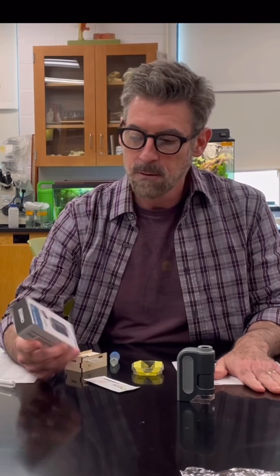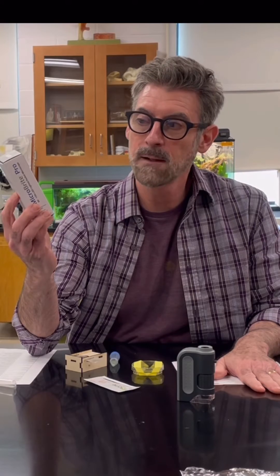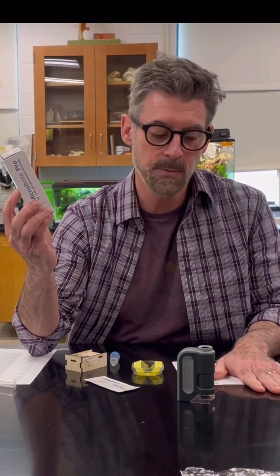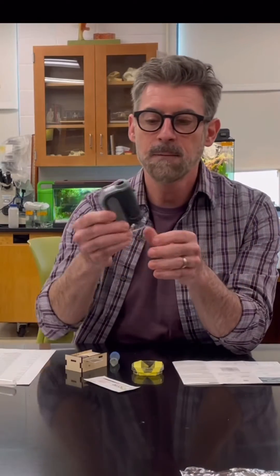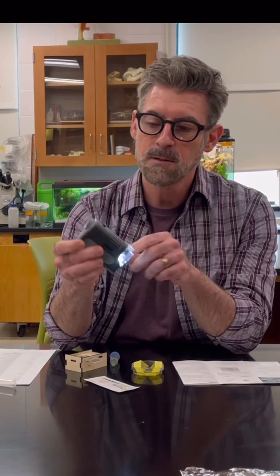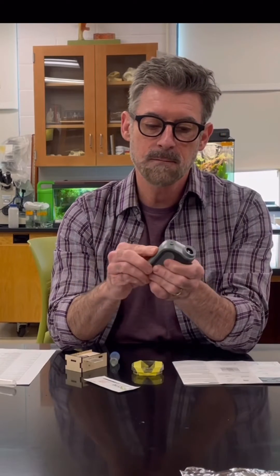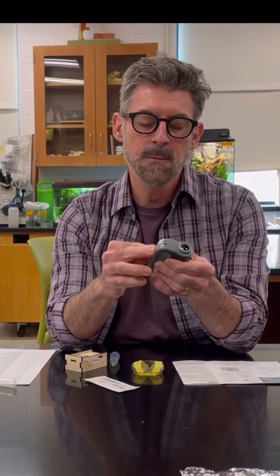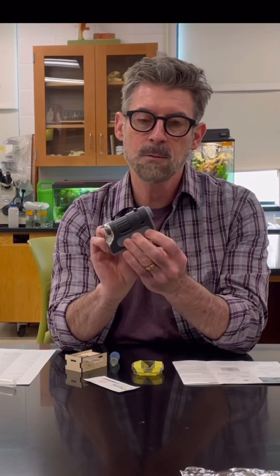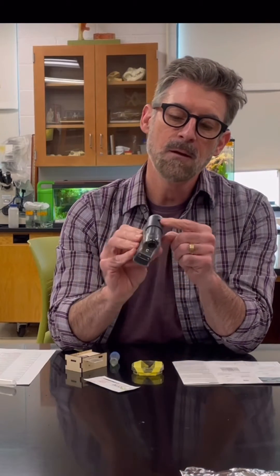In your laboratory kit you're going to find one of these: the Carson Microbrite Pro pocket microscope. This is the one that comes in the box with the kit. The scope has a little light - you're going to have to put a battery into it. It should come with the battery. Once you put the battery in, you have a little light switch on the side that turns on the light on the bottom.